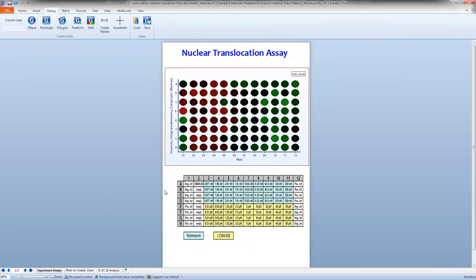One of the things that a lot of people who are working with high-content imaging or flow cytometry-based data do is generate IC50/EC50 curves for their data, and they want to be able to get those inflection points on the curves. And what I wanted to show you is we actually have a plate-based data set. This is an imaging data set that we've loaded into FCS Express Plus.